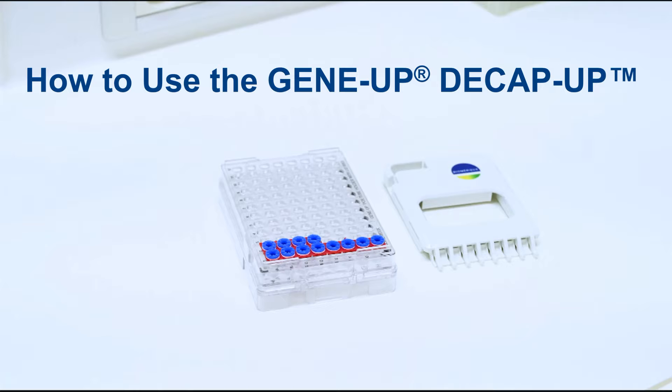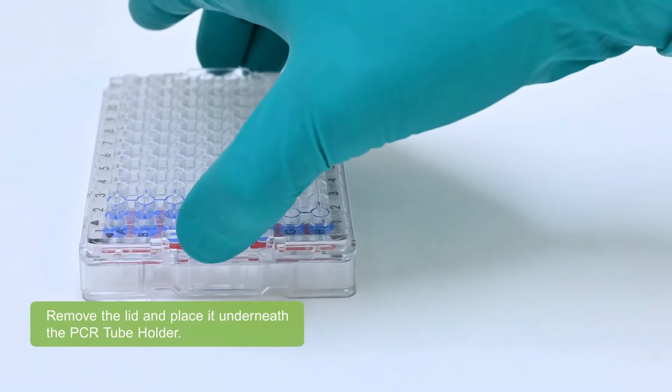This video demonstrates how to use the GeneUp D-Cap Up. Remove the lid and place it underneath the PCR tube holder.